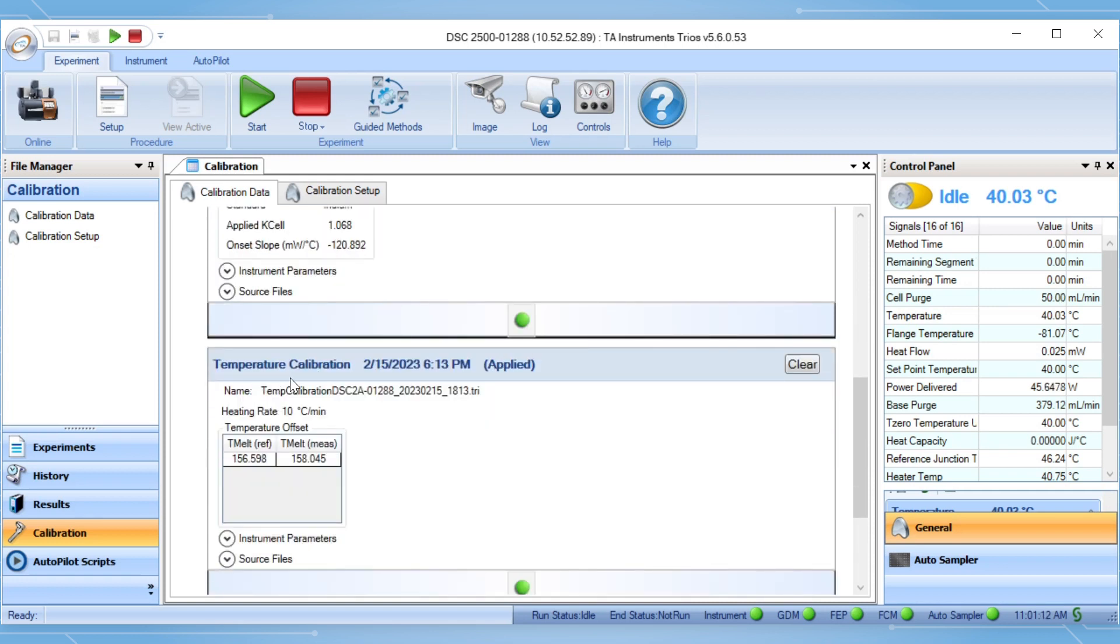The verification will be run to verify that the calibration is applied correctly and that the measured cell constant and melting onset of indium are within the verification criteria.